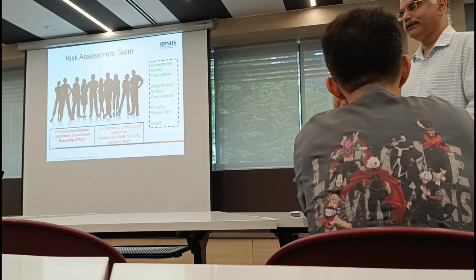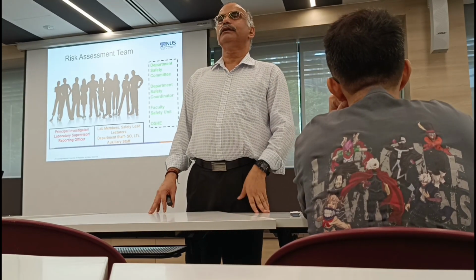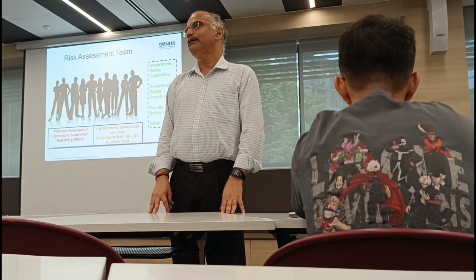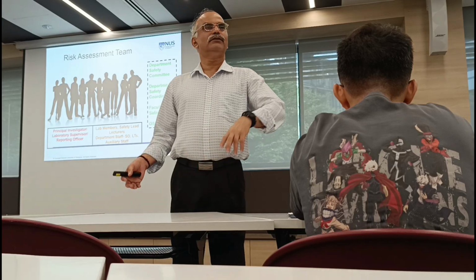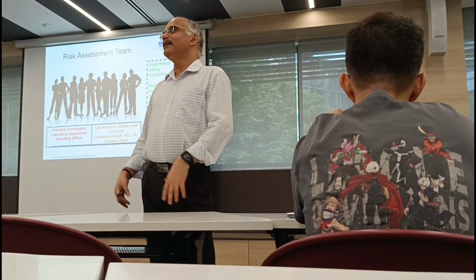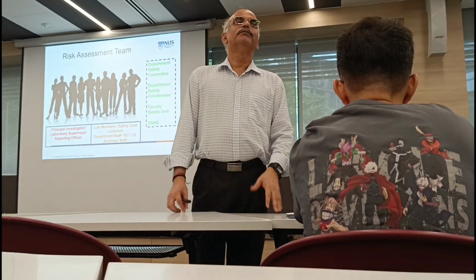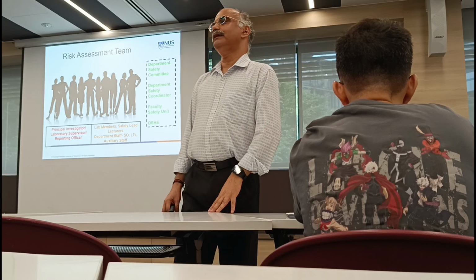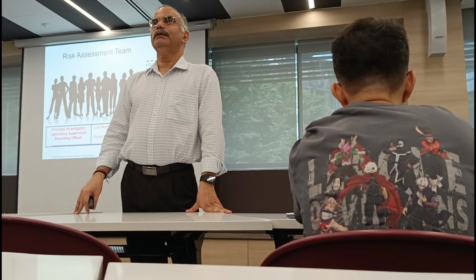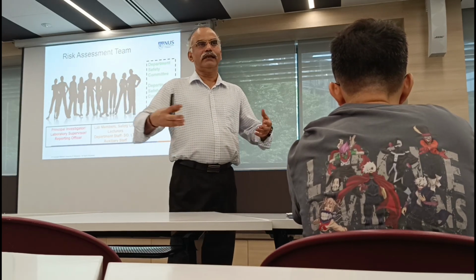Sometimes, we don't do it anymore. In the past, we used to make gold nanoparticles using thiol as a capping agent, and these thiols are really, really stinky. So what I usually encourage them to do is don't do it when everybody is working in the lab, right? You open it either on a Saturday morning or evening when most of the people have left, then you're probably able to do this. Just that step, adding the capping agent to the nanoparticle solution, right? And so most people probably don't have to go through that stinky smell of thiols.